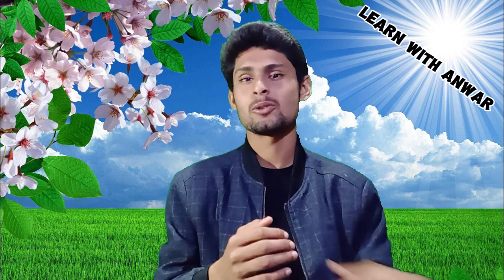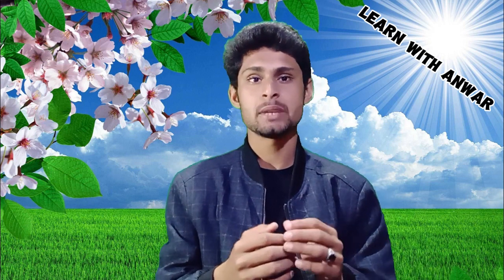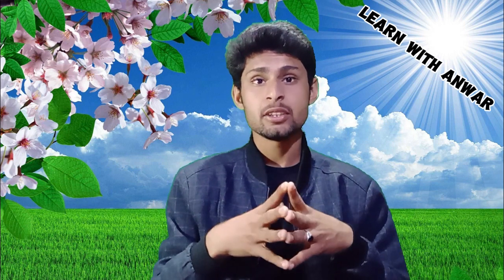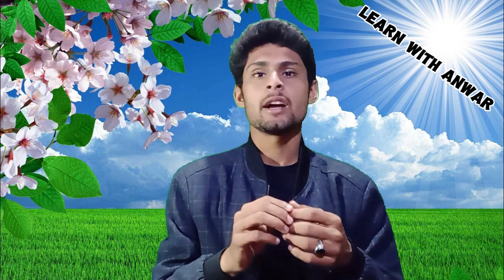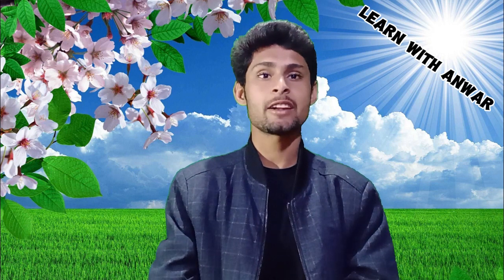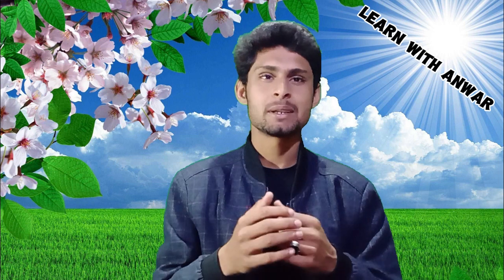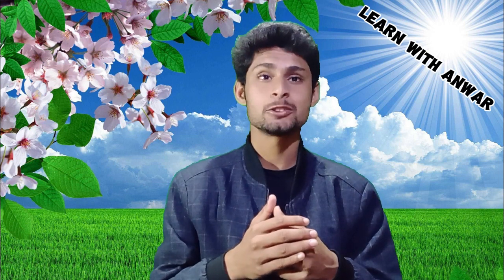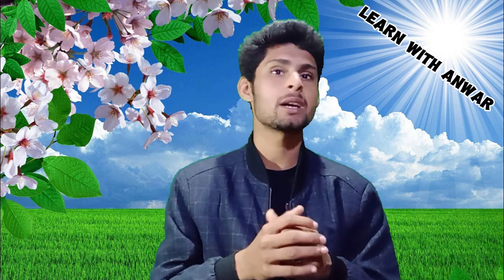Although optical microscopes are the subject of these articles, an image may also be enlarged by many other wave forms, including acoustic, X-ray, or electron beam, and received and directed by digital imaging or by a combination of these methods. The microscope may provide a dynamic image, as with a conventional optical instrument, or one that is static, as with a conventional scanning electron microscope.